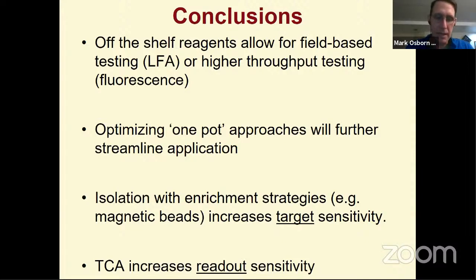So one of the key considerations is the robust nature in which LAMP and RPA DNA amplification occurs. Because of the robustness of these methodologies, it's very easy to cross-contaminate work surfaces. And so being able to do these methodologies within a single step would increase both sensitivity as well as accuracy by not having false positives due to contamination, which is a very real concern, particularly with these robust amplification technologies such as RPA. So these are conditions that we continue to work on.